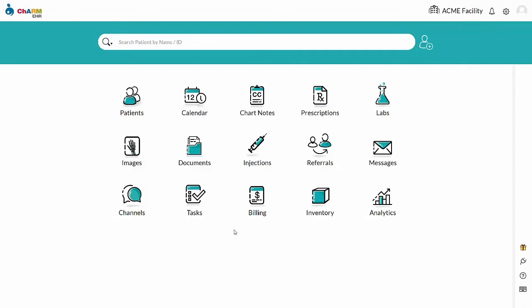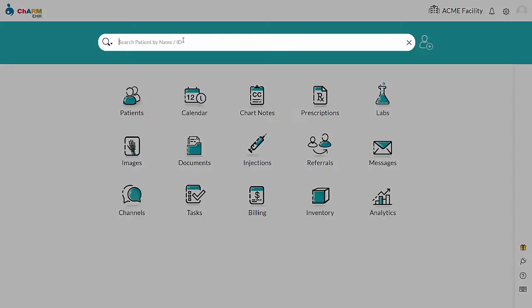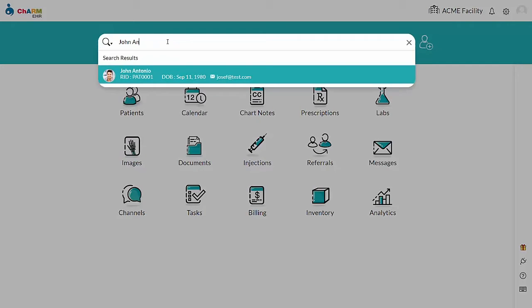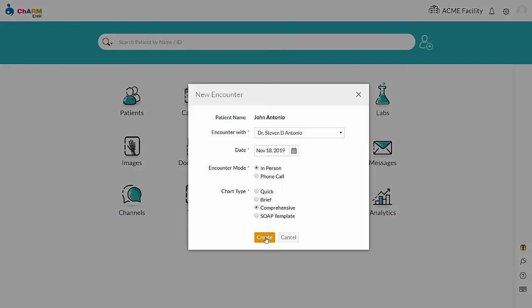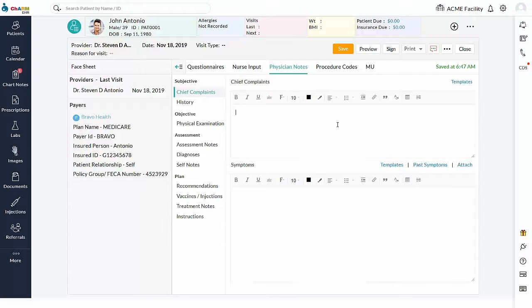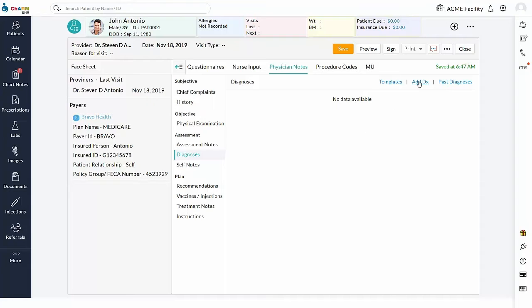Lab orders can be created from the chart note and lab orders section. In this section, we are going to see creating lab orders from a chart note on a patient's visit and transmitting them electronically to Charm Labs. Search patient and create encounter. From the diagnosis section, add diagnosis.